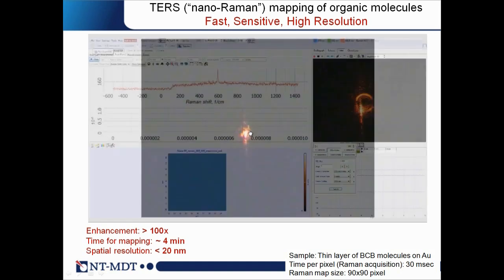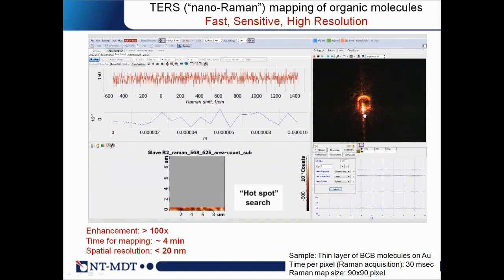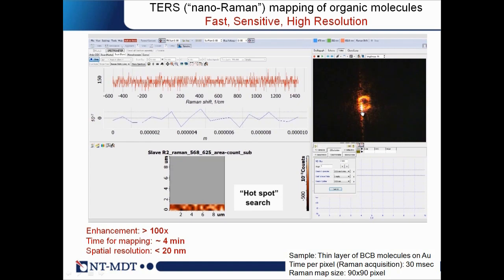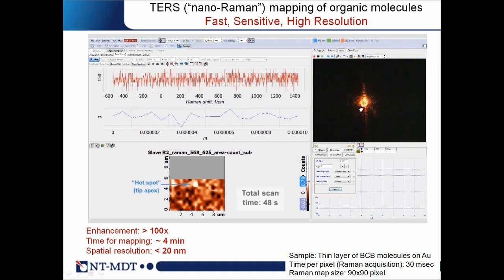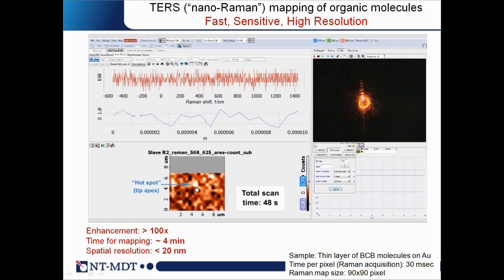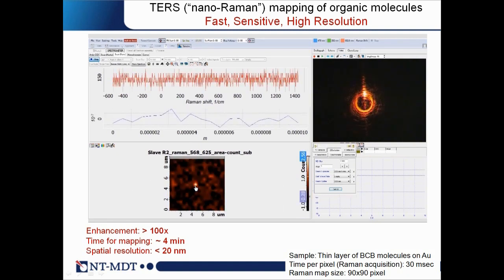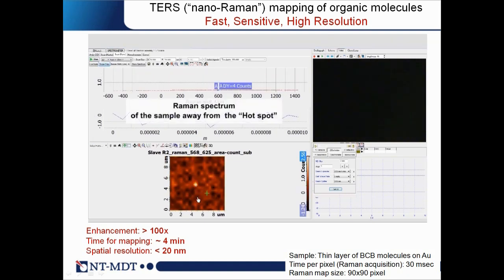We manually move the laser around the tip just to do a rough alignment, and then the next step, as in my previous video, will be to scan with a laser spot around the area of the tip. So the end of the tip is somewhere around here, and while we're scanning, we're collecting the Raman response from the sample. So here is the hot spot. Here is the place where the tip has a localized surface plasmon, and it is touching the sample, and the sample produces an enhanced Raman signal due to the presence of the tip.